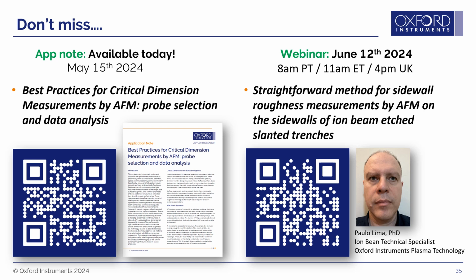Okay, great. There are several questions about AR Maps. First one is, can I analyze several images automatically in AR Maps? I could take that one. That's one of the beauties of AR Maps: once you define one of these analysis recipes, you can apply it to as many other images as you like. So it can generate tables like those ones that Marta was showing you, where it shows the critical dimensions for a series of different images. Assuming that the samples have similar features and you're doing the same analysis on each image, then absolutely.